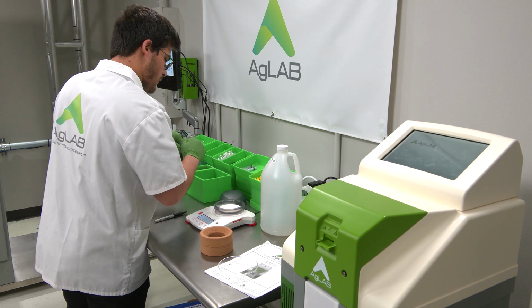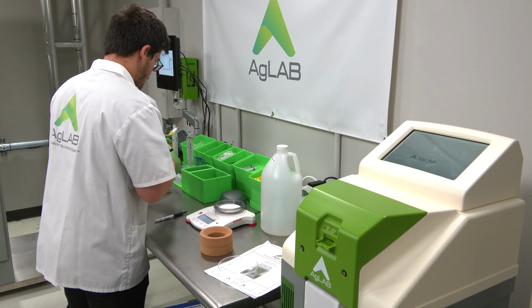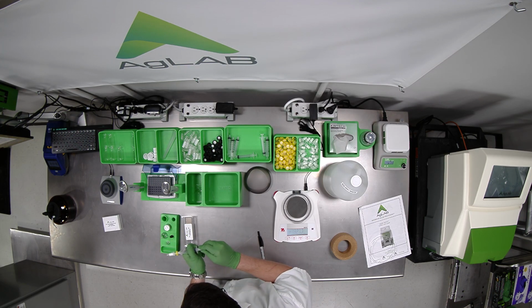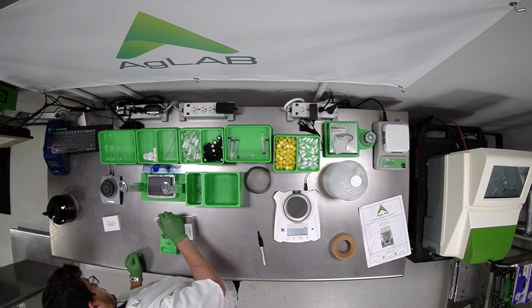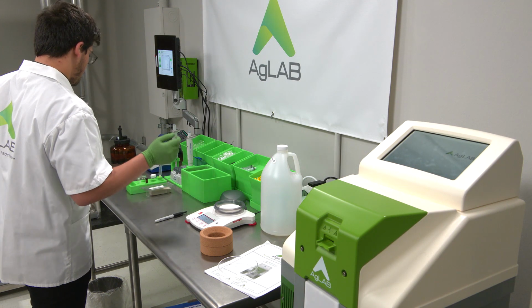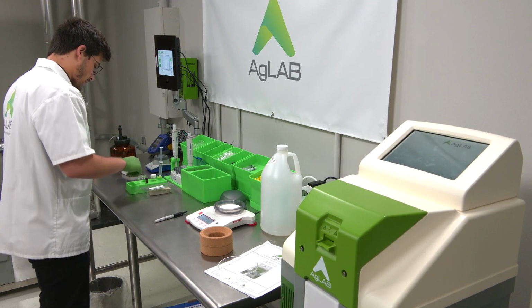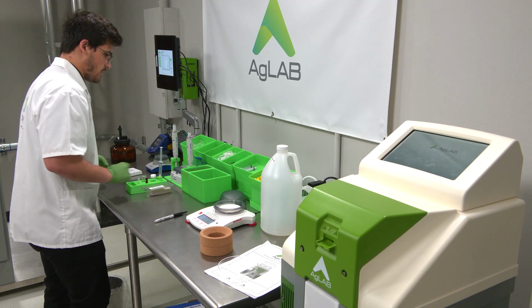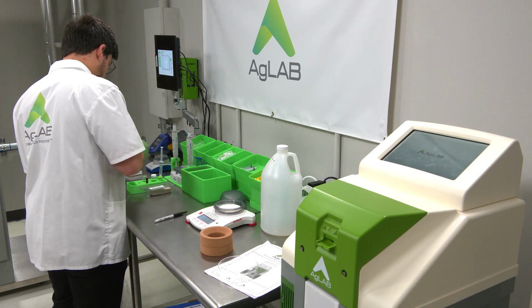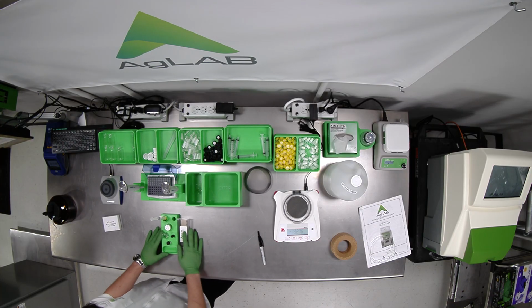Head samples will require a nylon filter along with a quick catcher. Just place this back in here, have that set up. And the reason I reconnected my plunger is just to try to avoid any possible contamination, as well as these open vials here. It's good practice to go ahead and attach their caps so that they're not just open to the air.